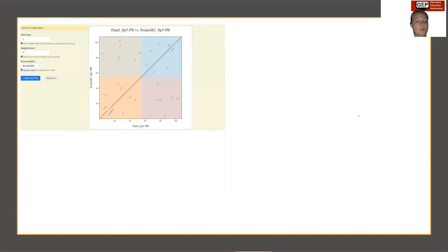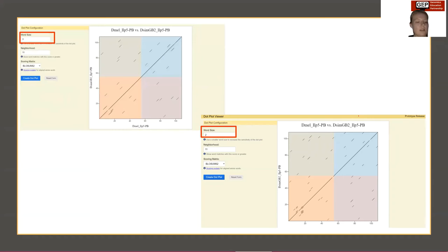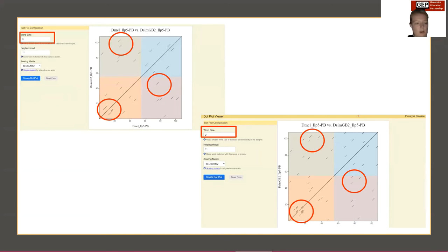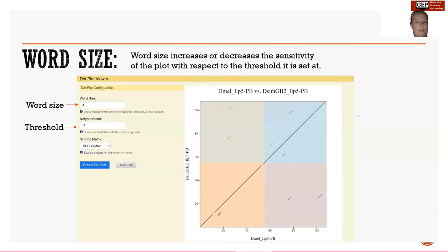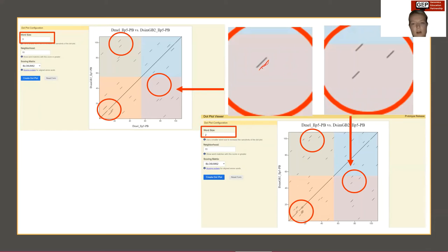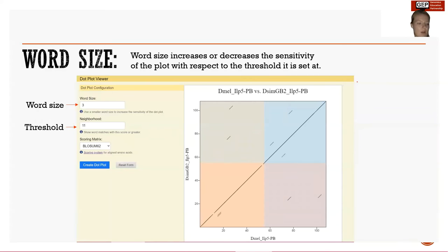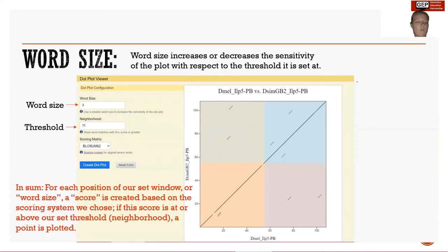Now keeping our threshold the same but decreasing word size: with word size of three versus word size of two, we notice more marks appear. We can also see that the overall size of each mark has slightly decreased due to the decrease in word size — we have reduced the number of amino acids we are analyzing from three to two. In sum, decreasing the word size increases the overall sensitivity of the plot, whereas increasing the word size will decrease the sensitivity.